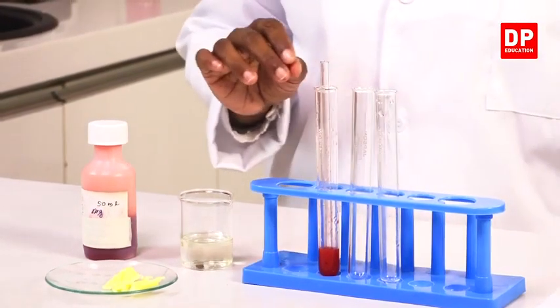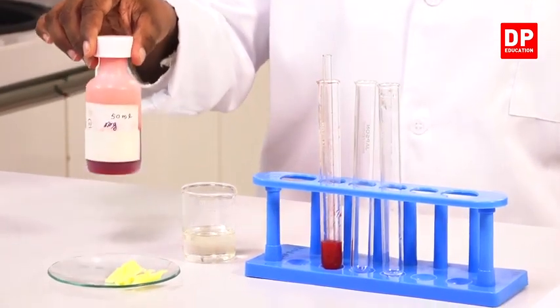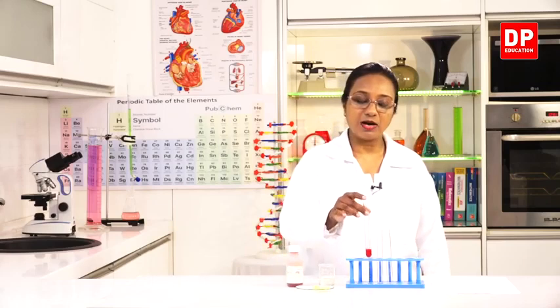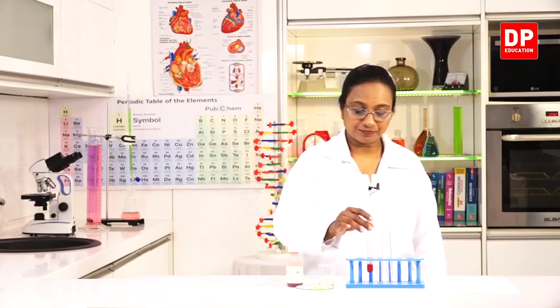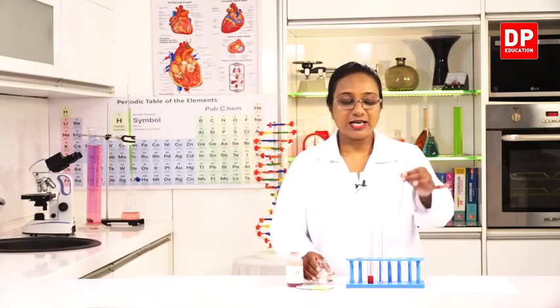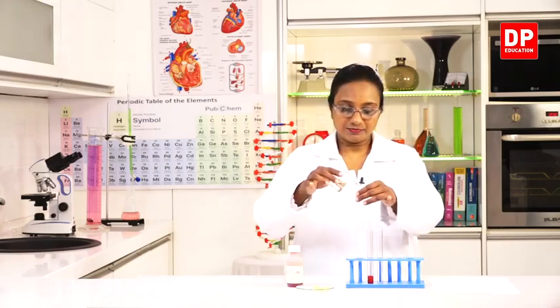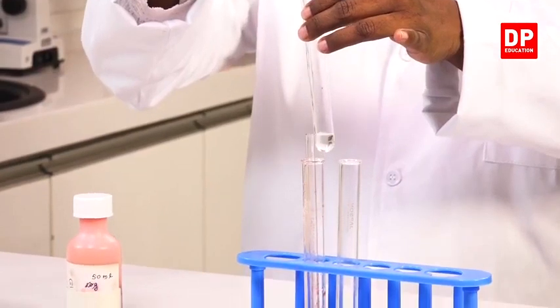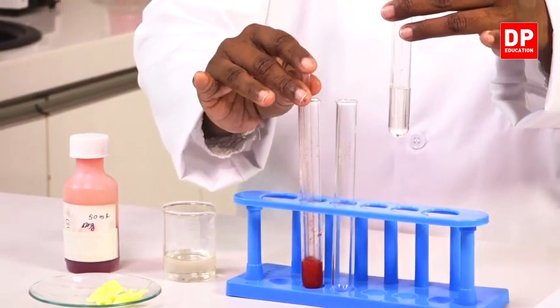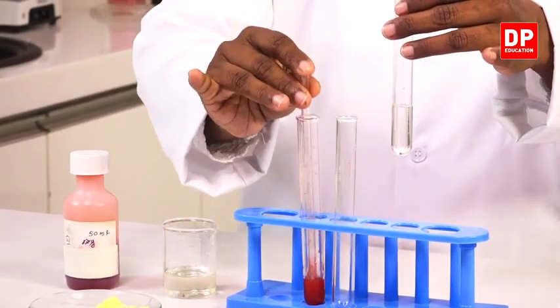And the reagent that we are going to use today is Sudan 3. I have already taken a small amount of Sudan 3 into a test tube. You can clearly observe the color of Sudan 3. It is a red color solution. First, a small amount of oil is taken into a test tube. To that, we have to add a few drops of Sudan 3.